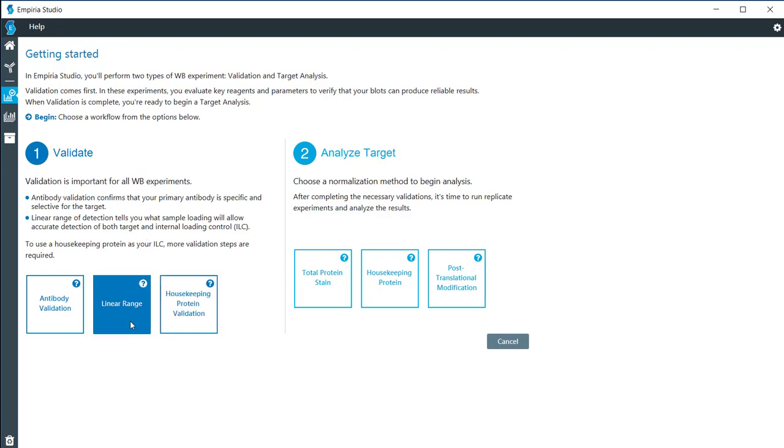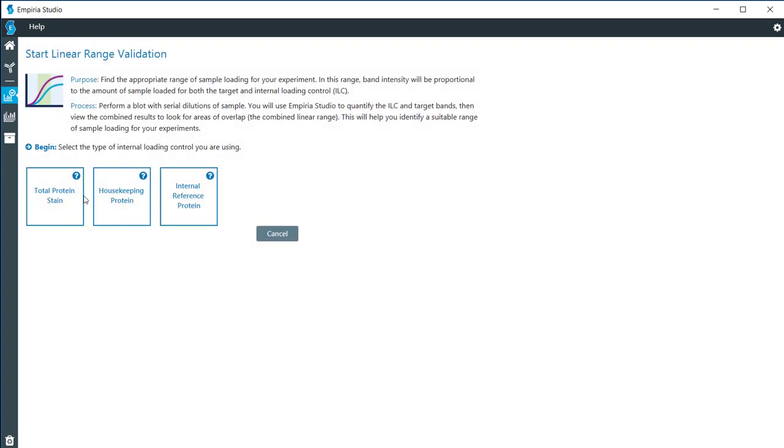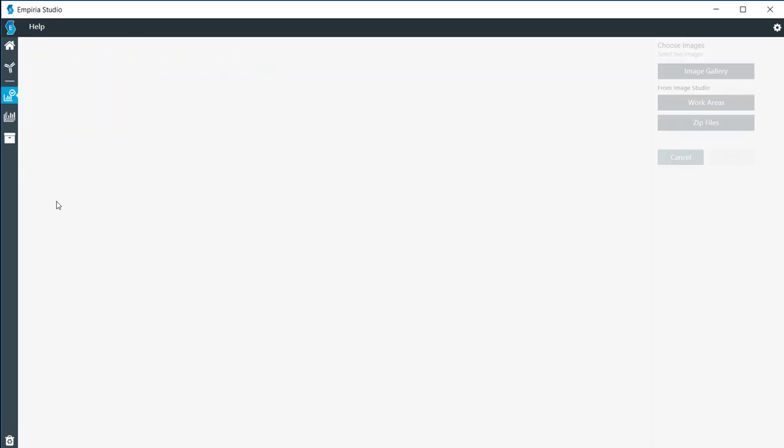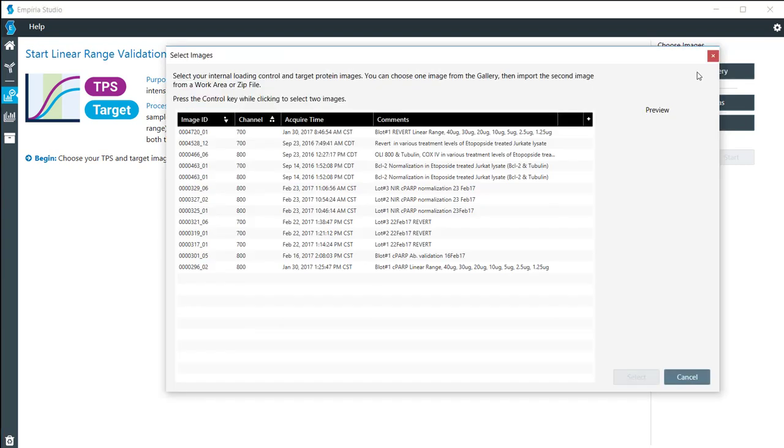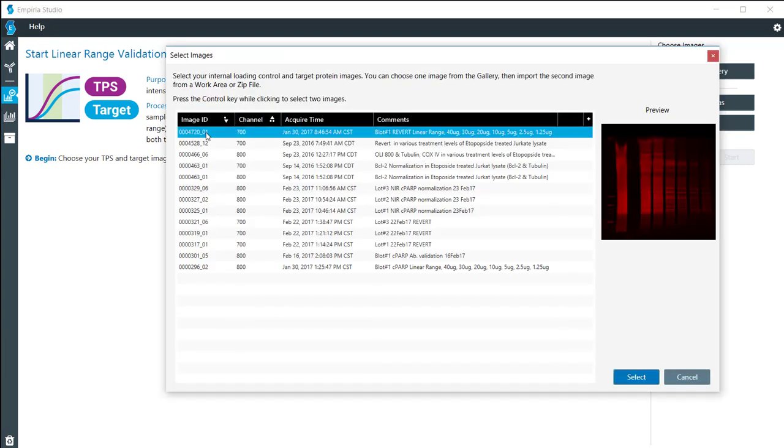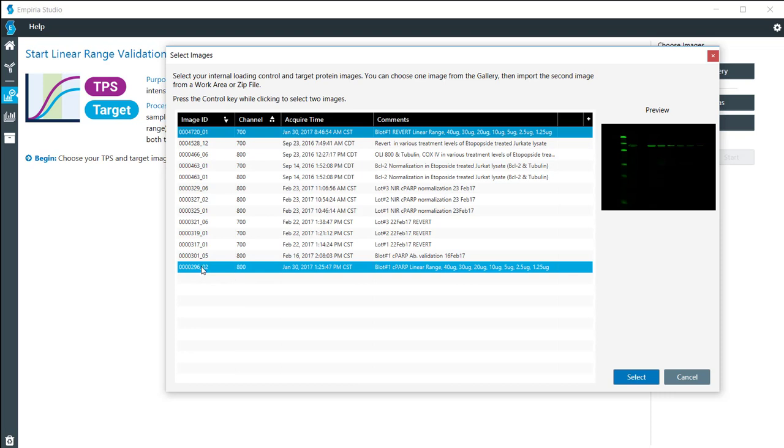When I click on linear range right here, the images that I'm going to be using have a total protein stain used. Normally I would pull in images from the work area or zip files, but I'm going to look at the image gallery and find the images that I need for this.